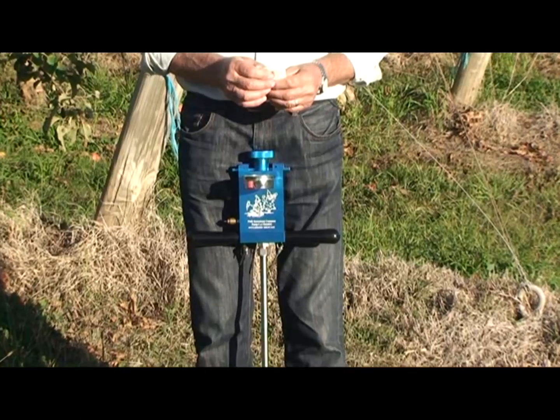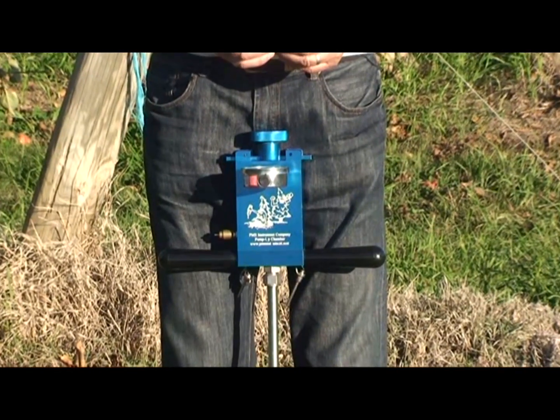My name is Harold Adam from the Victorian Department of Primary Industries based at Teixeira. To schedule irrigation accurately, we can use the internal water status of the tree. We can measure this using a pressure chamber.